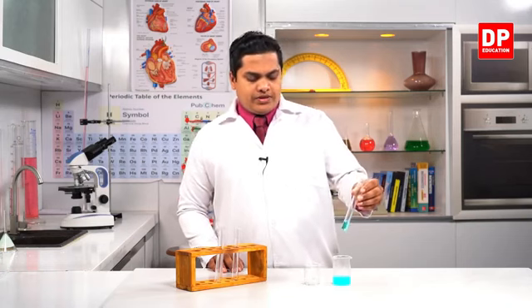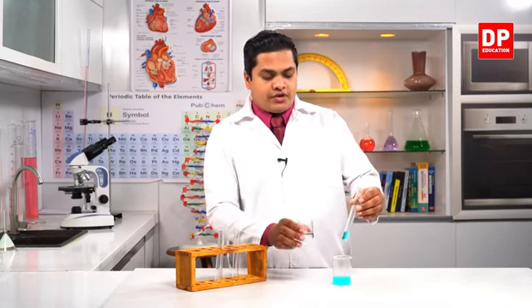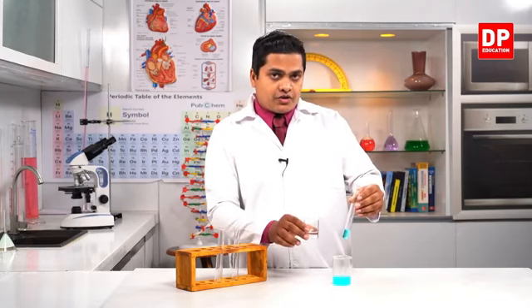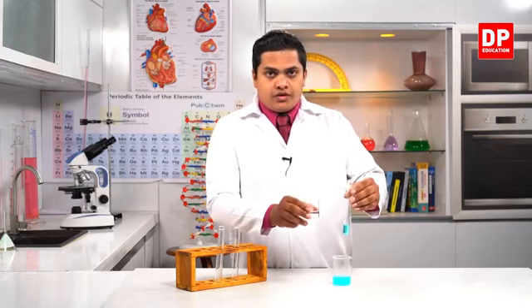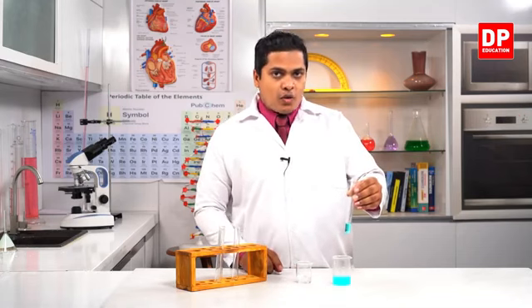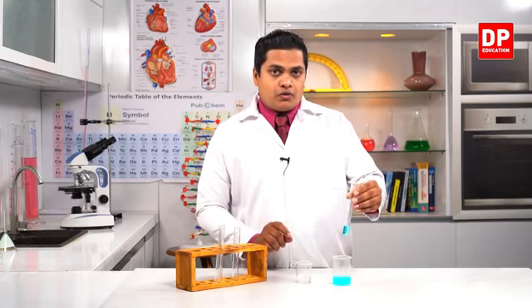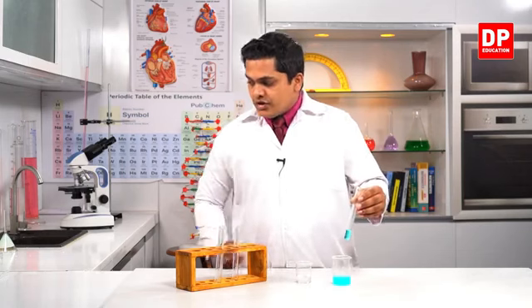Now what I'm going to do is add this sodium hydroxide solution into the copper sulfate solution. But I'm not just going to pour it in here. To get somewhat clearer observations, I'm going to use a dropper, and I'll use the dropper to put this sodium hydroxide into the copper sulfate solution.